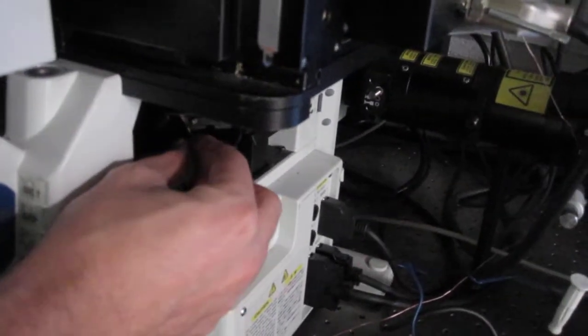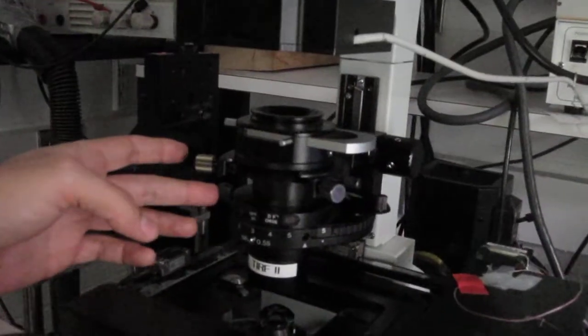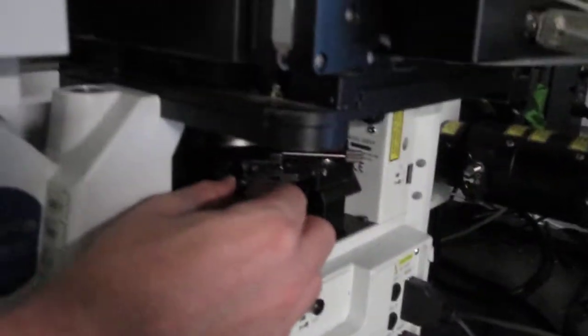Now, if we want to do DIC, then we have to put this thing in. These are the different prisms for DIC. I'm going to put this prism in. This prism also goes in. We want to open this out completely, this selector here.